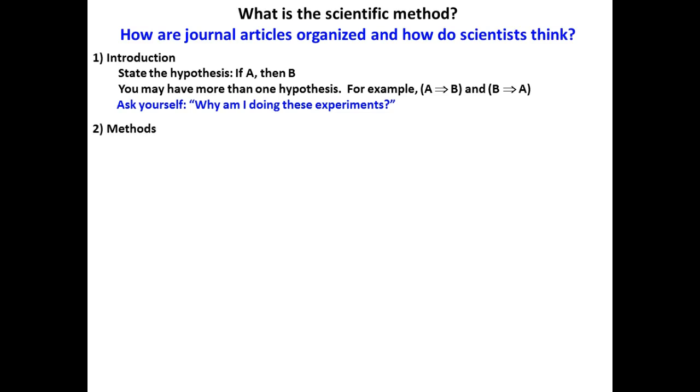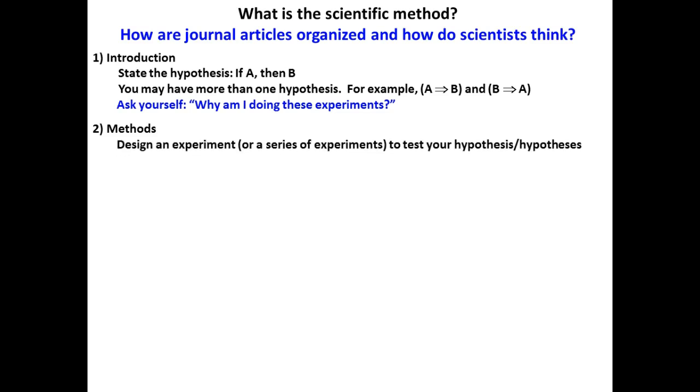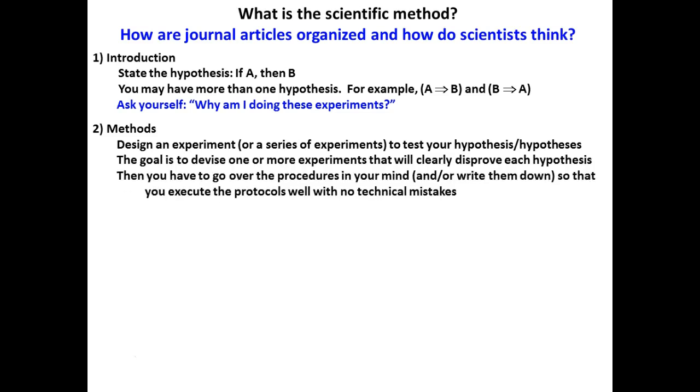Methods: how do I do this? We're going to use widely used and approved methods. Protocols, that's what those methods are called, procedures. We have to do them correctly. You have to come prepared to class as you guys have. Write out your procedure. Follow your procedure. If you don't follow your procedure, what should you do? Document that you screwed up. And if you were doing an experiment, you would have to what? Start over because you did not follow the protocol that you meant to follow.